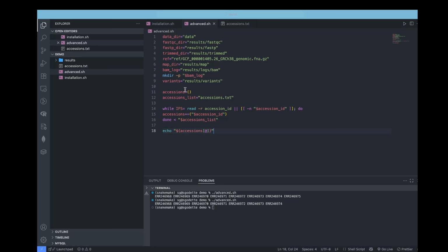The next thing we then want to do is to use fasterq-dump to download these FASTQ files in a way that is much more efficient and doesn't require us to manually input the accession numbers in our main code area. So to do this, we can write a for loop that iterates over every single item within the accessions array and then runs fasterq-dump on every item in that array.